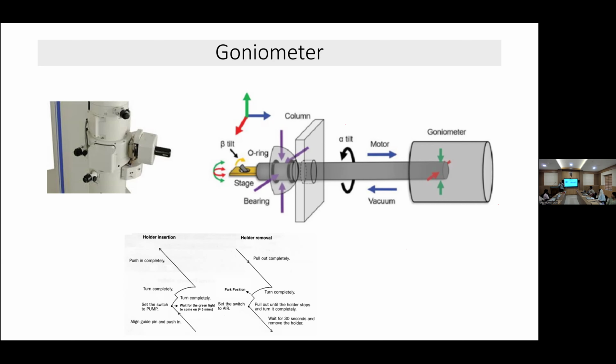There are two chambers separated with a shutter. So we can close this region and separate it from this region. If you want to load something, then we keep it in the chamber, close it, then create the same atmosphere as on the next chamber. Then open the shutter and take it. That is the thing.